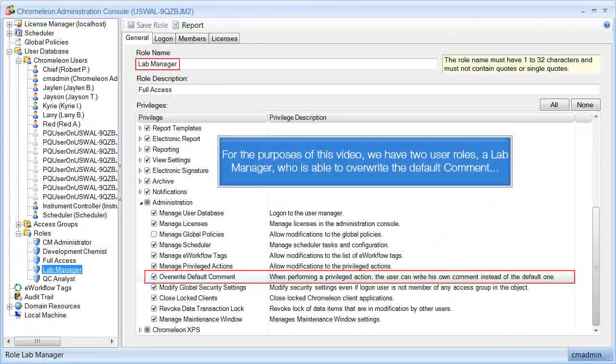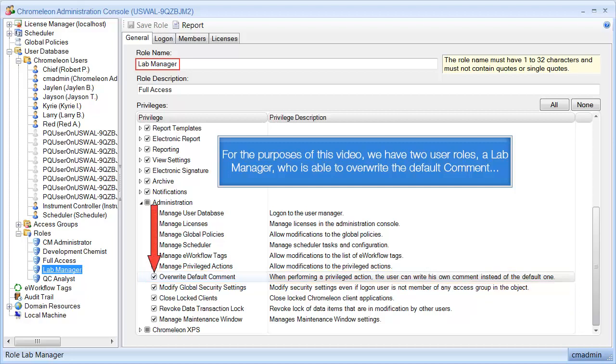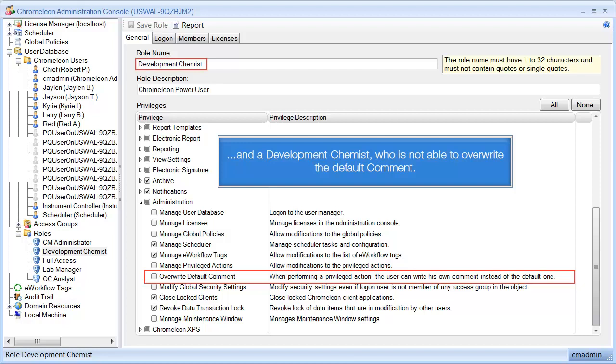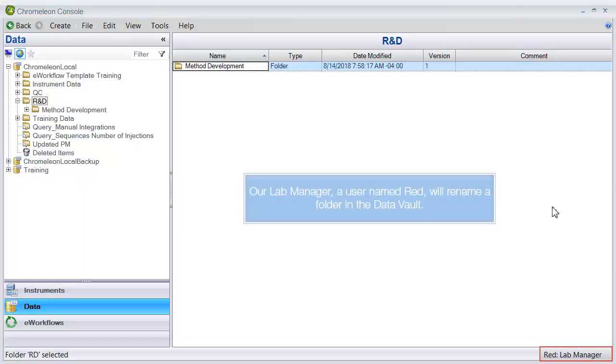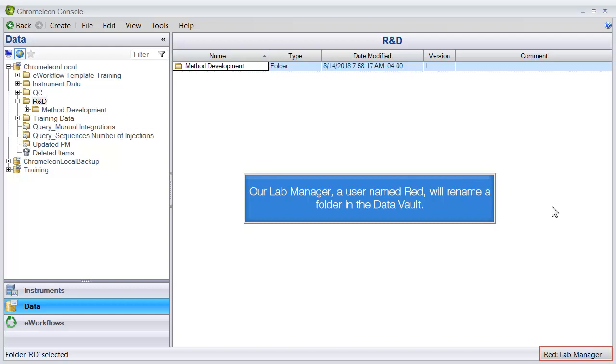For the purposes of this video, we have two user roles: a lab manager who is able to overwrite the default comment, and a development chemist who is not able to overwrite the default comment. Our lab manager, a user named Red, will rename a folder in the data vault.